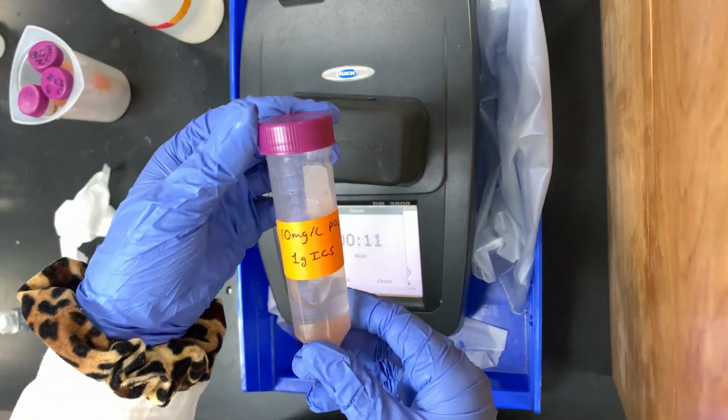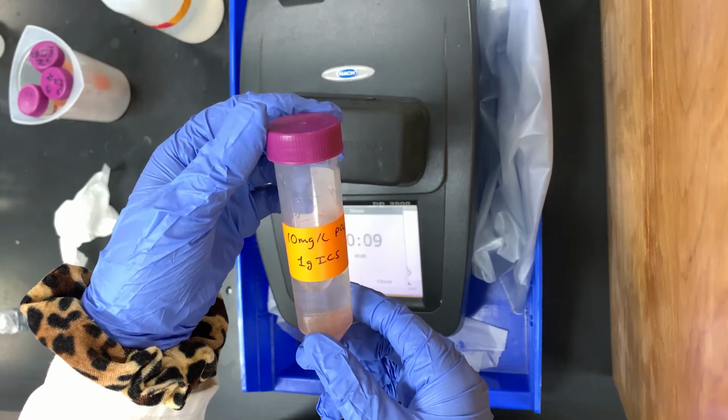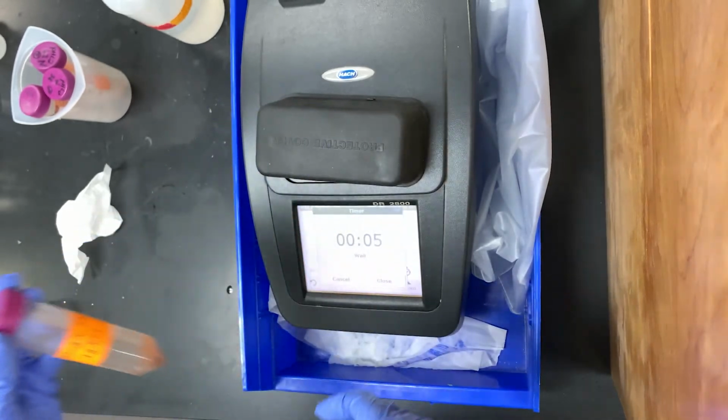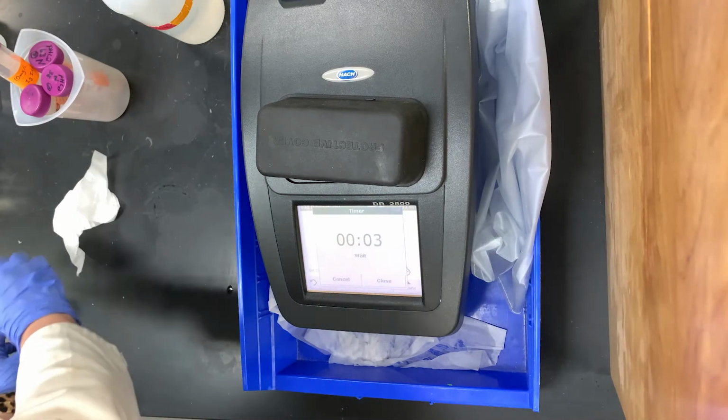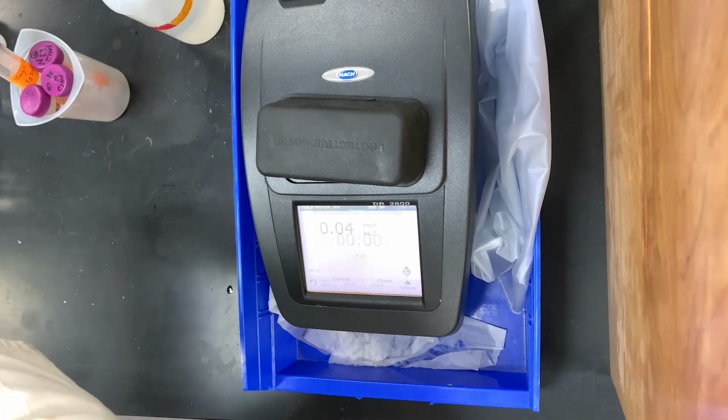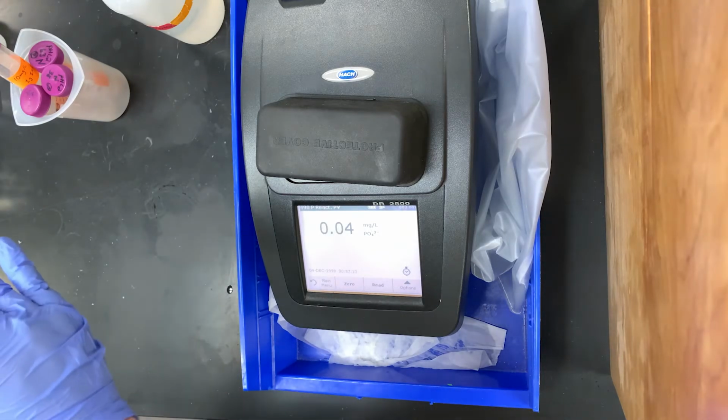So finally, we will do our 10 milligram per liter phosphate solution with our 1 gram of iron-coated sand to determine the final concentration. I forgot to show the 5 milligram per liter solution on camera. I thought it was recording, but apparently it wasn't. But I'll show the results from that in the next clip with all the data.